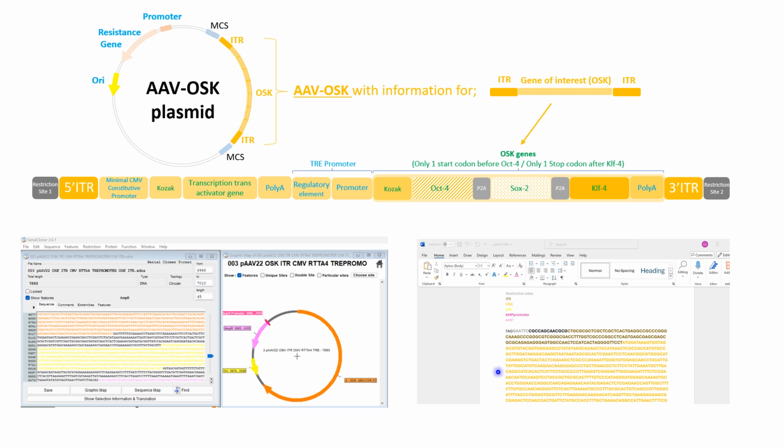You see here, right? Every single part of the plasmid has a different sequence, and I have highlighted the different sequences in different colors. For example, this one that is orange corresponds to this part that is orange. The ITRs, you see here, this is the sequence for the ITRs. You see here, for example, here is exactly the same.